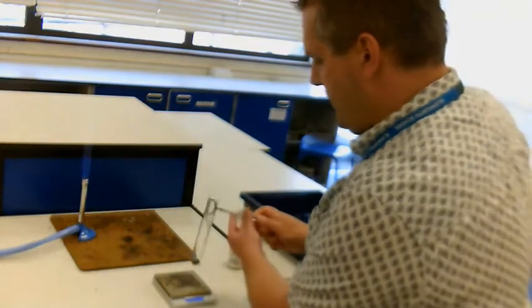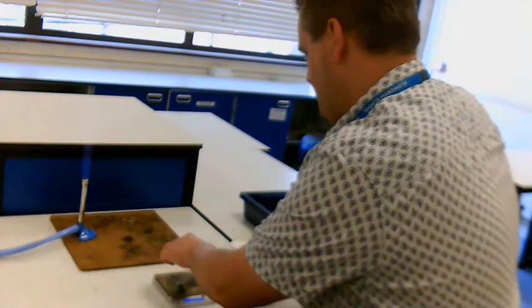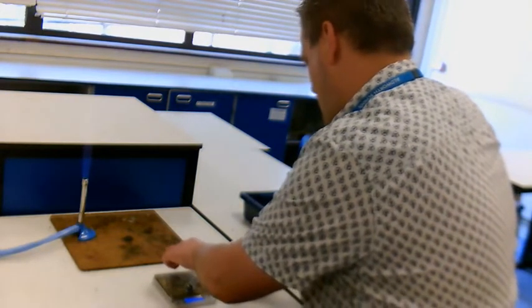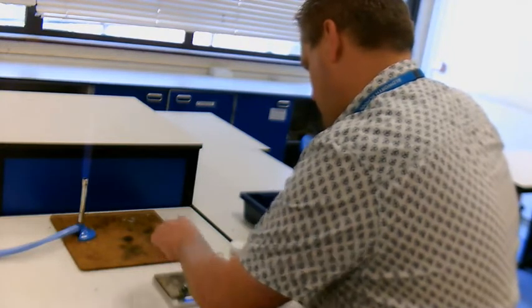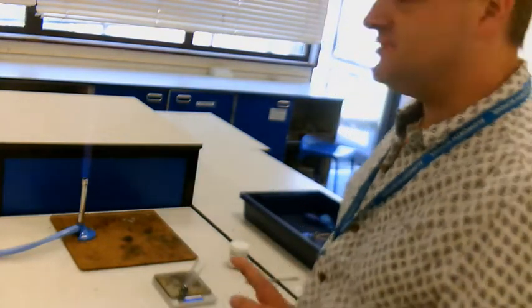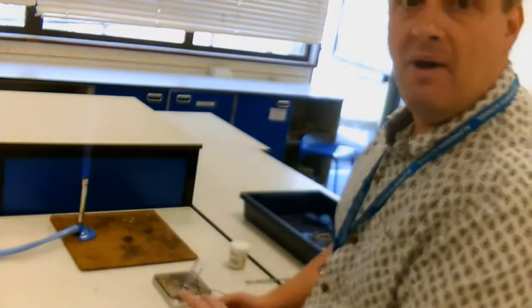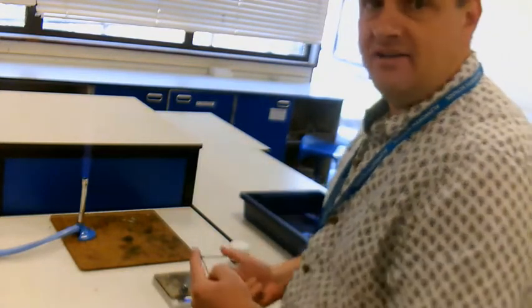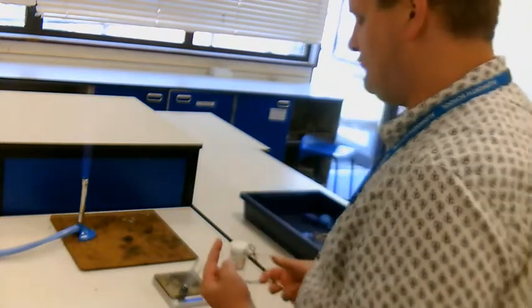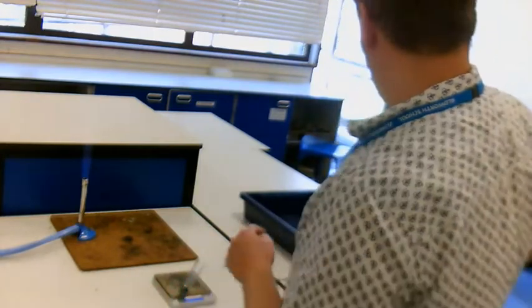So I'm also now going to just let that cool quickly, place that back on my scales, hopefully without burning my fingers, and the mass is now 32.14 grams. So I have lost mass. Somewhere, somehow, a chemical must have come off of this in order to make it lighter. So we'll talk about that in a second, and I'll go to my board and we'll talk about what happened in this reaction. But before we do that, while I'm still in front of the flame, we will gather a little bit of evidence and solve our problem with the balloon at the same time.